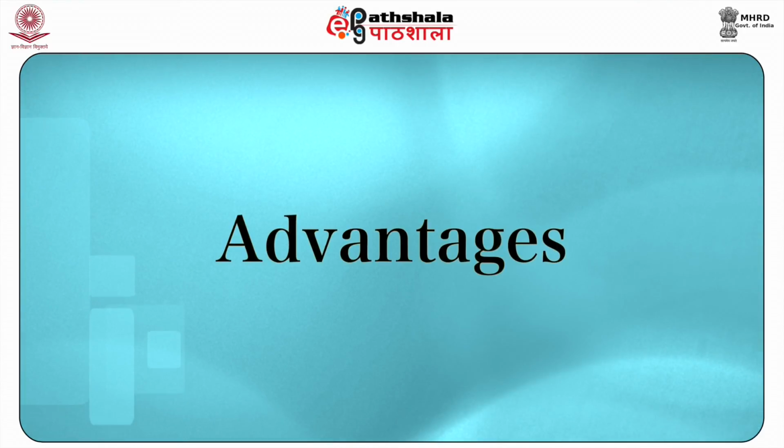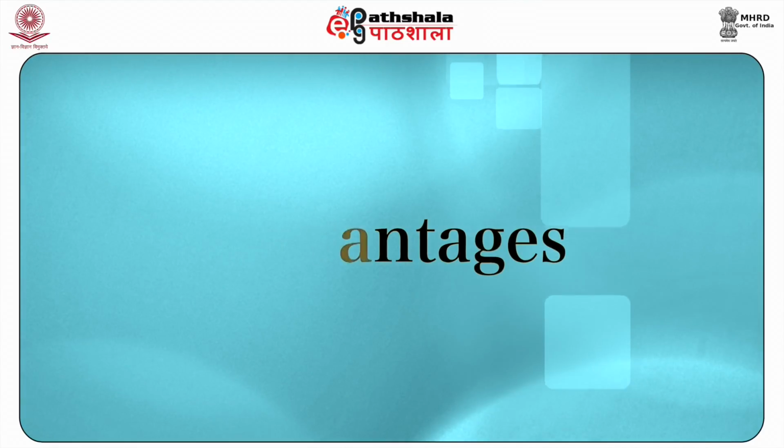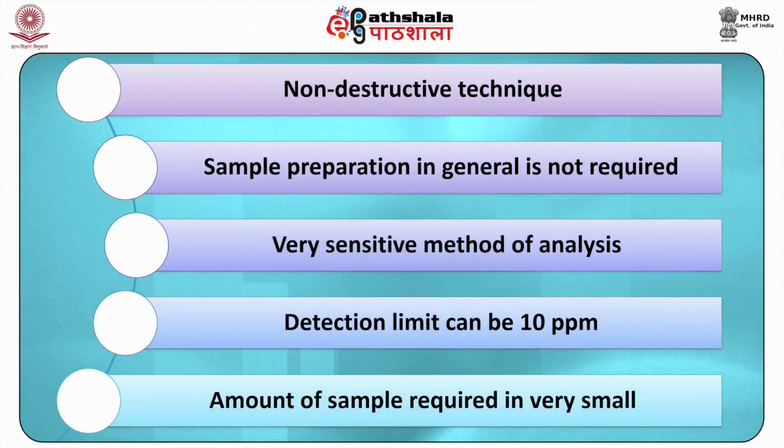Advantages. This is a non-destructive technique and thus the forensic exhibit remains unaltered. Sample preparation in general is not required. It is a very sensitive method of analysis. Detection limit can be 10 ppm, far superior to normal chemical methods. The amount of sample required is very small, which makes it more suitable for forensic work.